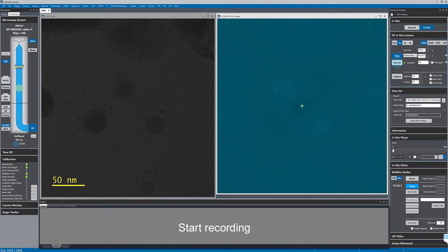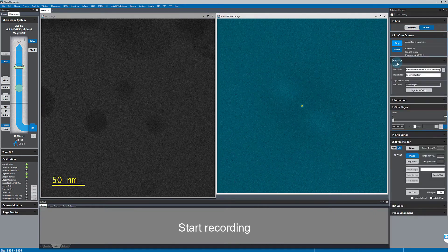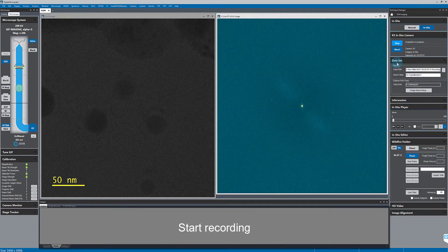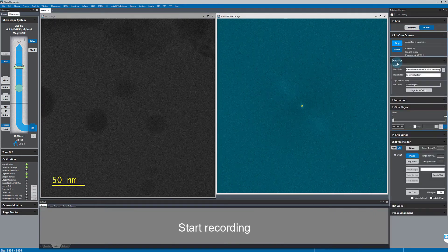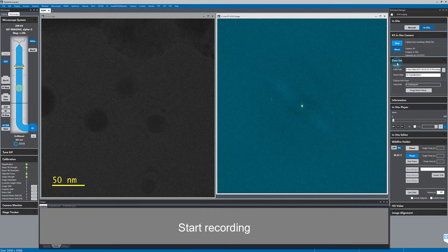There, now I'm seeing a spot in the FFT, so I've pressed record. And because I have look back set to five seconds, my video will start before that FFT spot appeared.